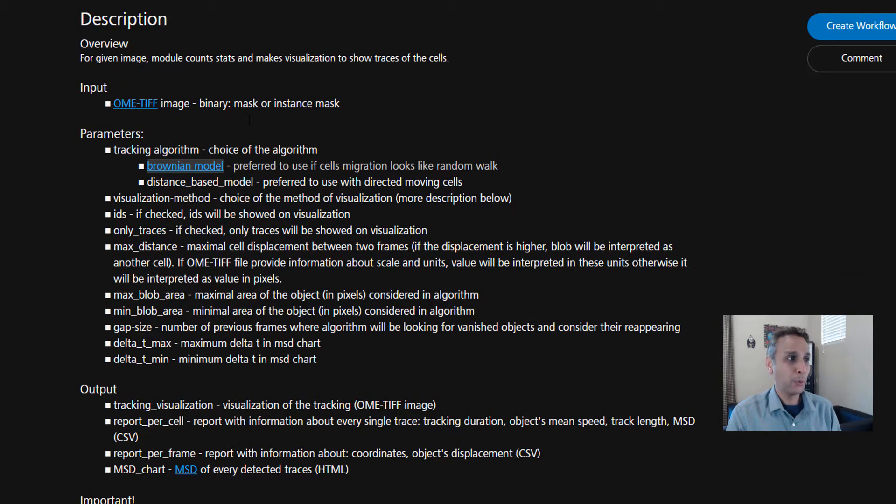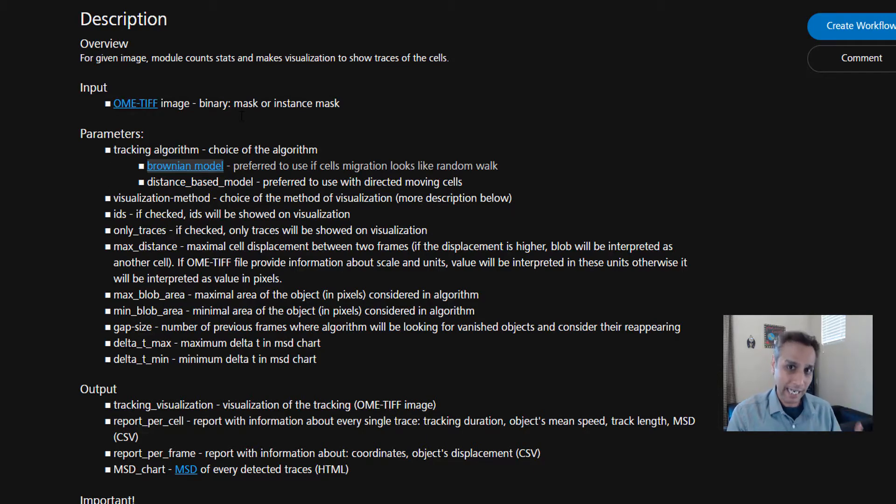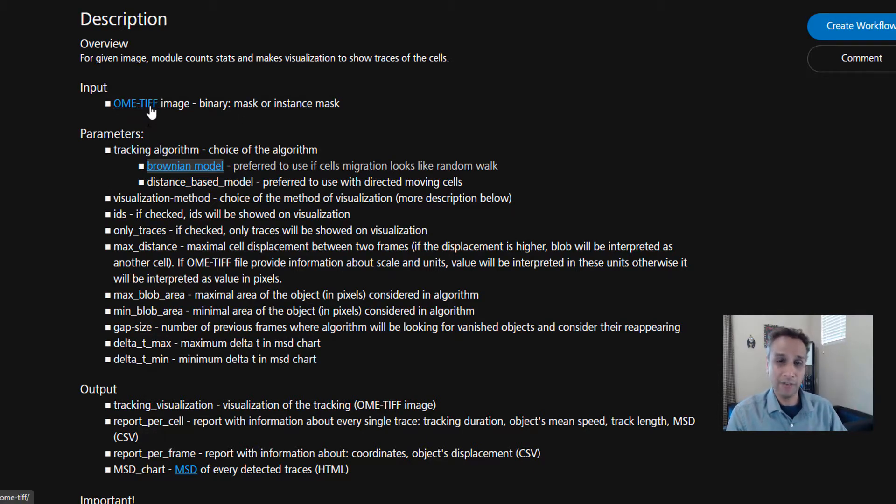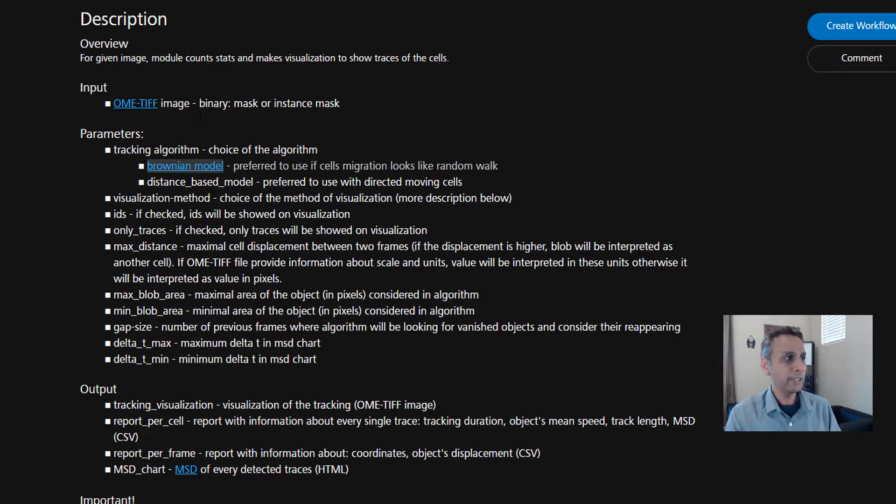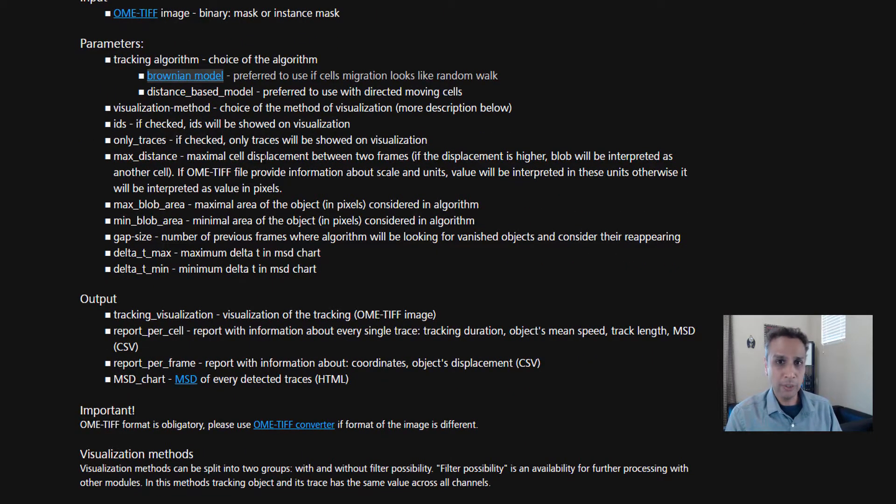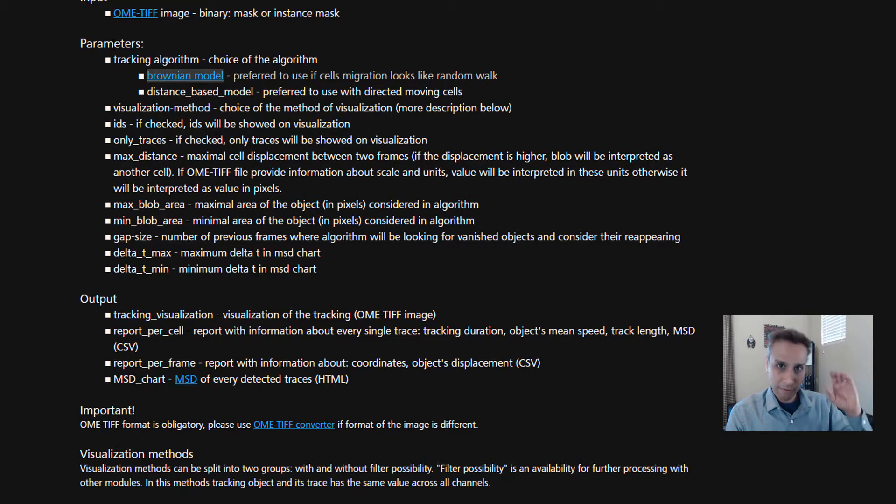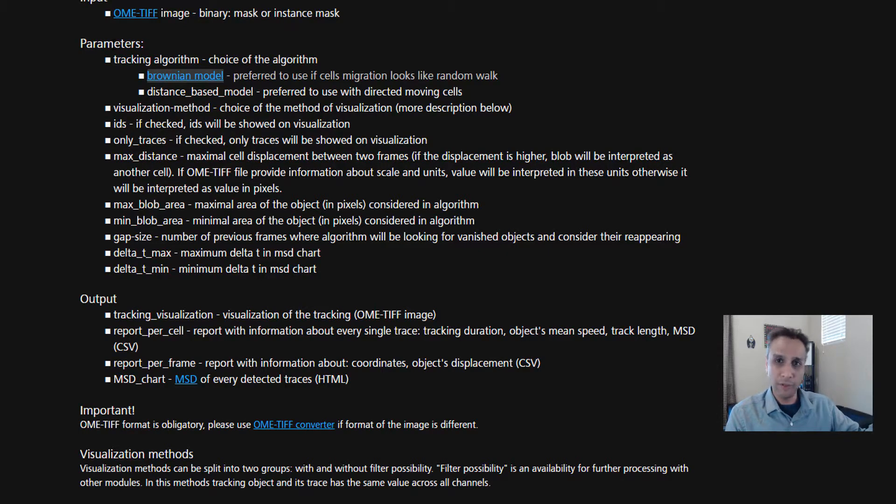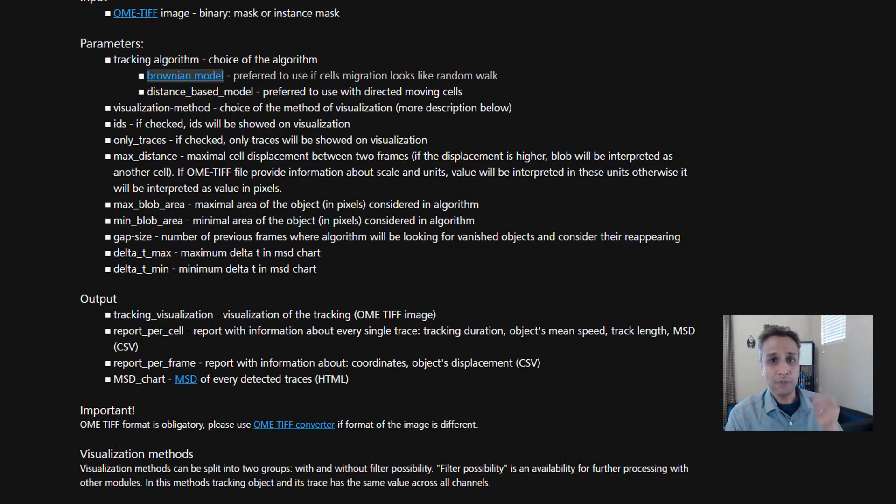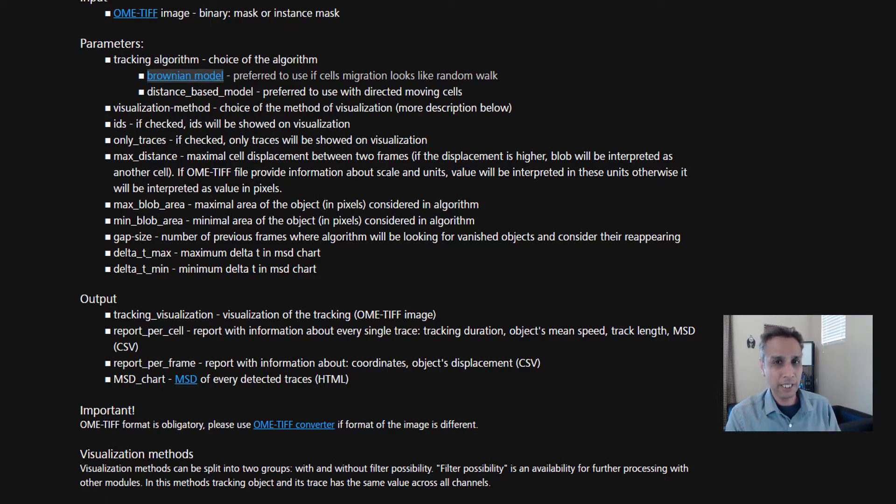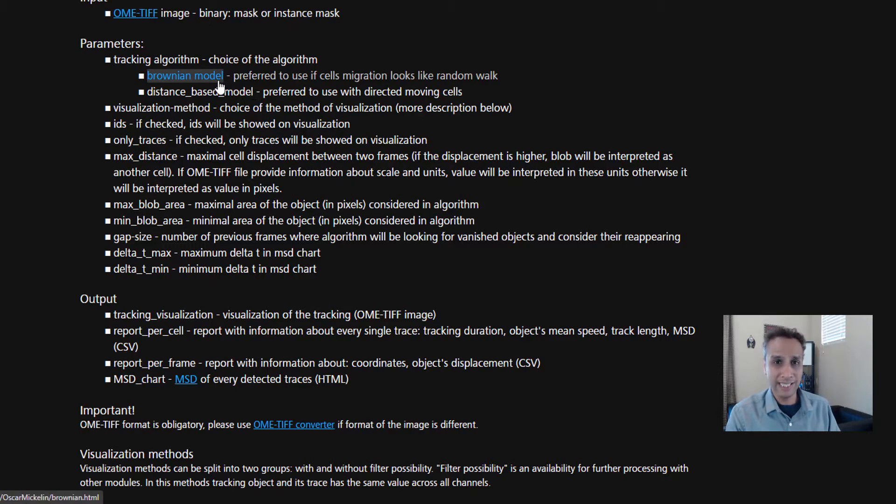Let's click on the first one that says blob tracking. This is the one that helps us track the segmented objects. My input file, which is in CZI format right now, needs to be converted to OME TIFF file format. We have an OME TIFF converter that we're going to use to do the conversion. When it comes to parameters, each module allows you to adjust parameters. Here, for the tracking algorithm, you have a choice of two: Brownian motion and distance-based.